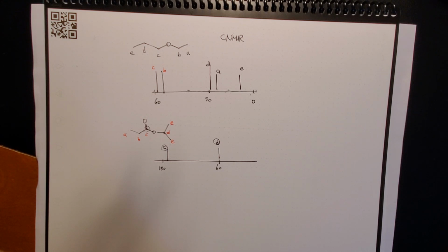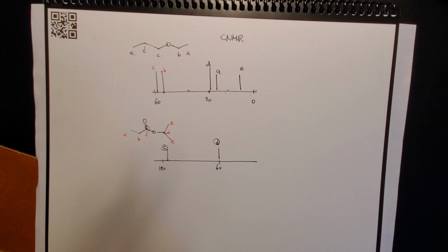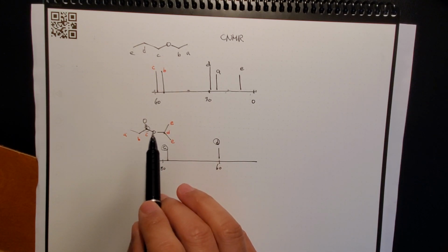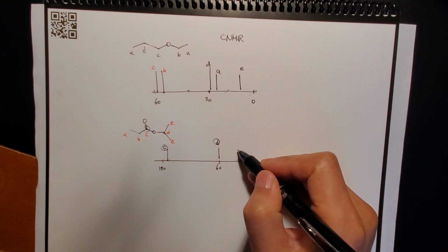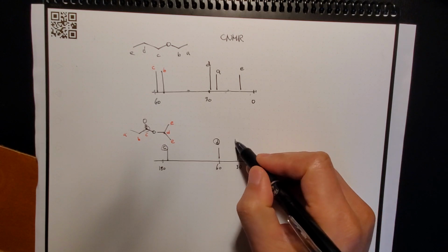Then what else? There are some betas now, right? So the CH2 here and the CH3 there, which is more de-shielded, you think? They have more hydrogens, and also they are beta to 1 oxygen, but this B has 2 oxygens in the beta location, and that has only 2 H's giving electron to the carbon. So that should be the next one coming. We cannot tell exactly again, but let's say about half, 30 for B.